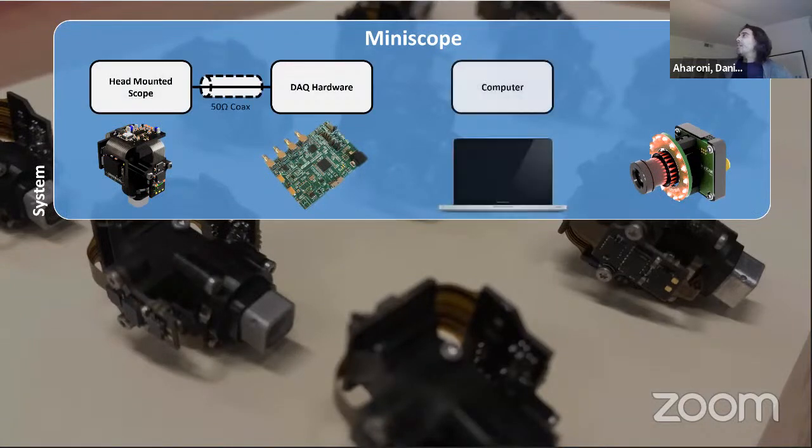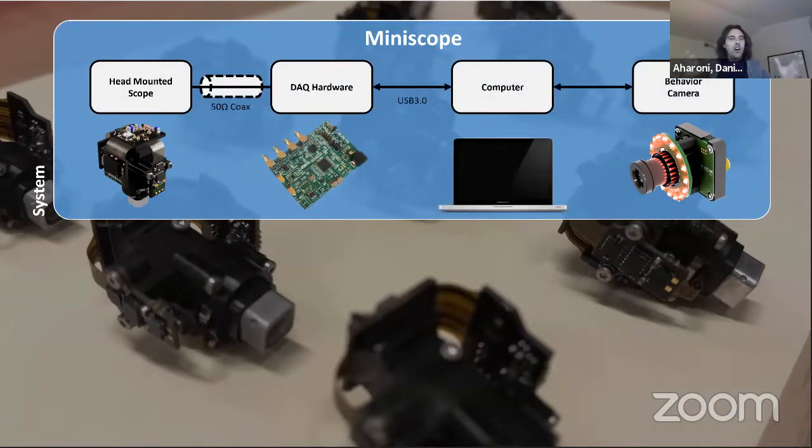All right, so the Miniscope project, we can think of being the hardware and system itself, and that consists of usually a small head-mounted epifluorescent miniature microscope. So this is a single photon excitation microscope, very similar to what you would see as a large tabletop fluorescent microscope. It just has everything that's not necessary removed, and then the remaining components made as small as possible. That is on the order of 3 grams or less to be worn comfortably on the head of a mouse.